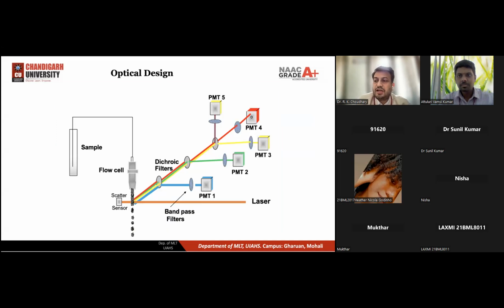Now the optical design. How it works in the optical design, just look here. This is the chamber.